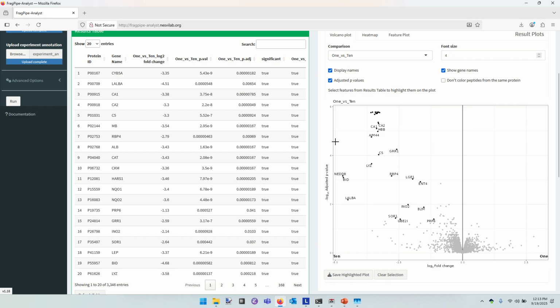And here all these magical proteins are. A great many of these should be proteins from the human database, representing the proteins that were spiked in at 10 times the concentration for that cohort. And that concludes the first demonstration of the day. Thank you for lingering past lunch. And we will now shut this down and wait until the start of the second demo. Well, it didn't actually stop.